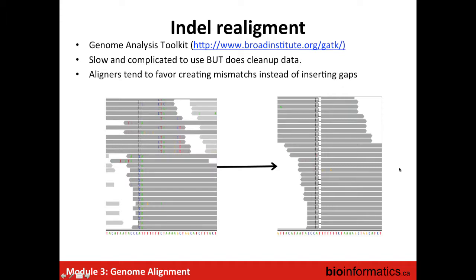There's no way to parameterize the aligner so that it doesn't create too many indels. That's not something they... It's not that it creates too many indels, it creates too few indels. Yeah, but usually you will probably have the opposite problem. You will have too many. There's no way, we don't find the perfect spot or perfect algorithm that is able to generate the perfect number. So it's either one or the other. The thing is that computationally, it's easier to favor mismatches than indels.